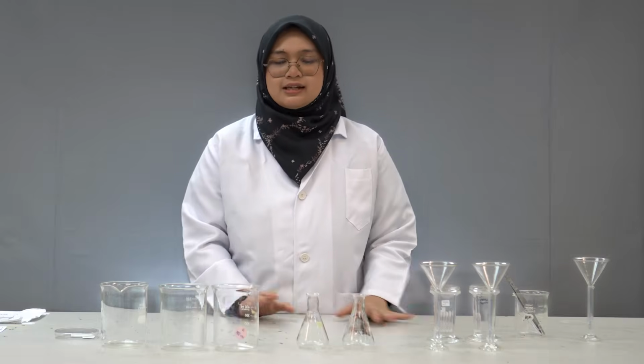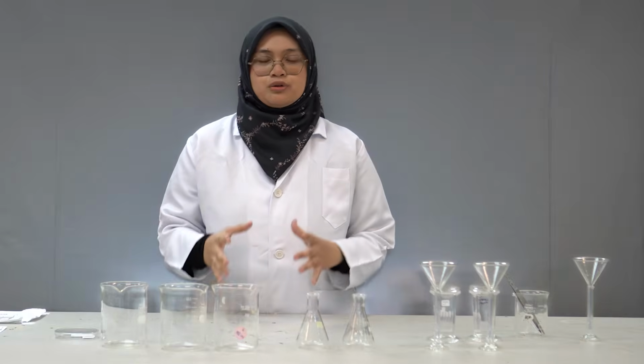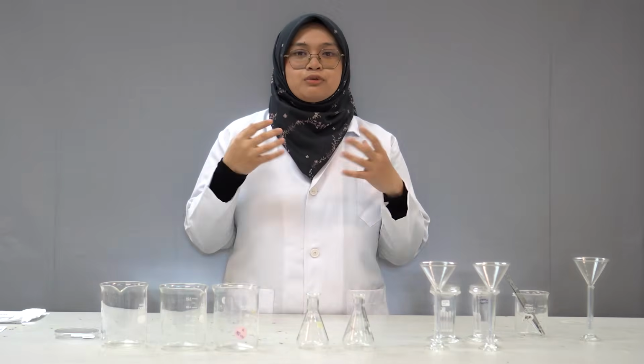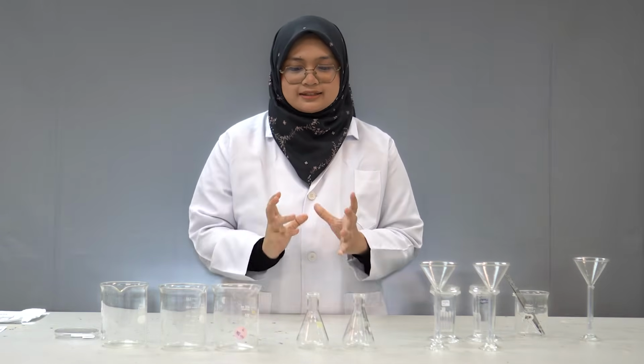Next, in TLC experiments, we have to spot the sample on the silica plate. The silica plate is very sensitive, so oil or dirt from our hands might disturb the movement of the sample. So we have to make sure our hands are clean and we are also wearing gloves. Okay, next.